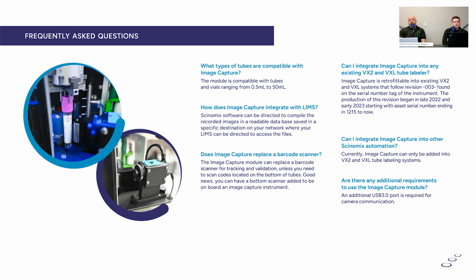And to note, if you noticed on the demo, we did a 2-inch tall, 1-inch wide label, which is about the largest that we utilize. So you can see that it fills up the full window of the image. That's about the max height as far as your labels are concerned as well.